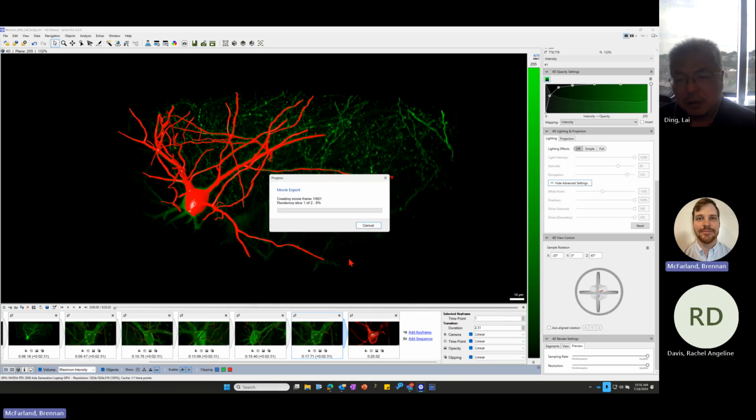So I'm going to hit record. It does take a little bit of time, and that's also the reason why I would recommend doing this at 1080p. Because if you're doing it at 4K, you're essentially more than doubling the amount of time it's going to take to load it. This is going to take a little bit of time to create this movie, again, because this is all just your preview.